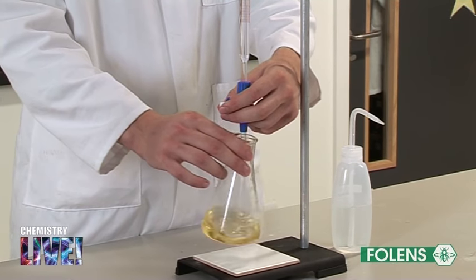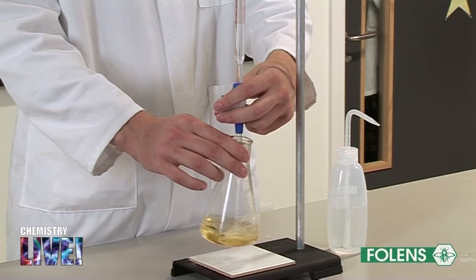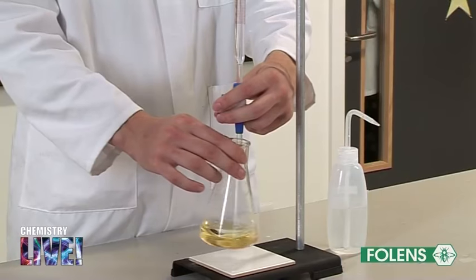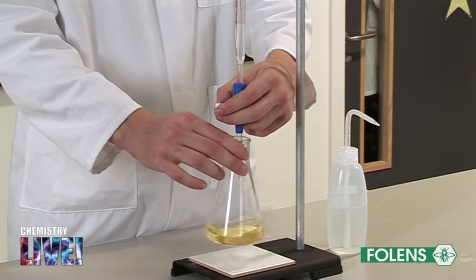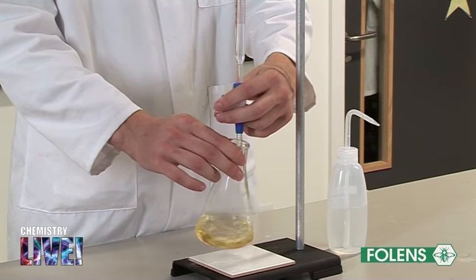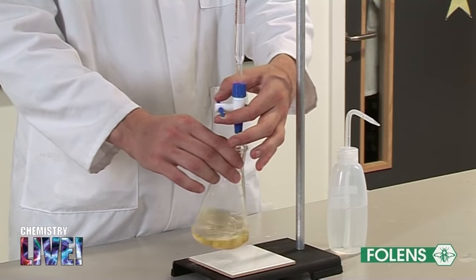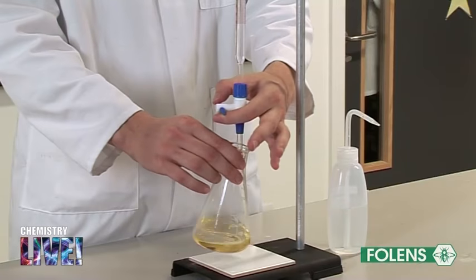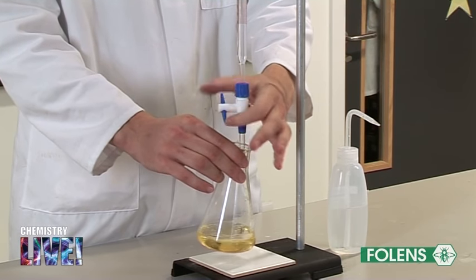When performing each accurate titration, one drop of acid should turn the solution in the conical flask a faint pink colour. Turning the tap through a revolution of 180 degrees allows one drop into the conical flask.